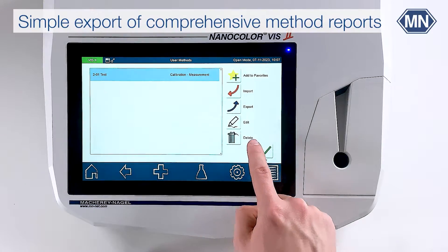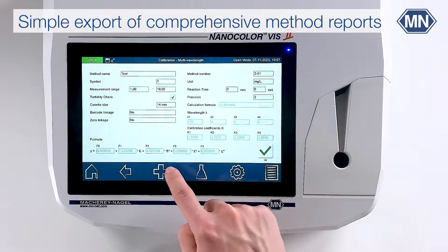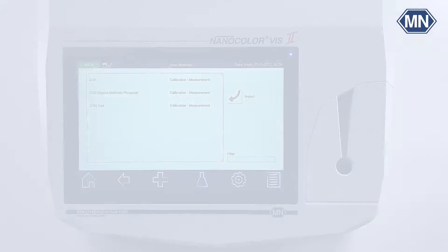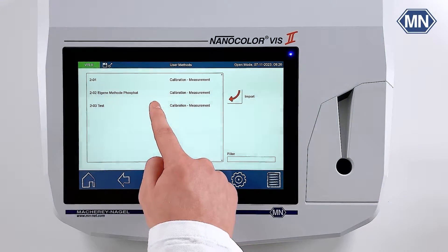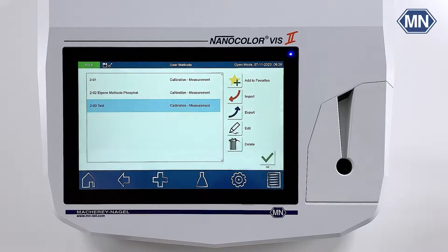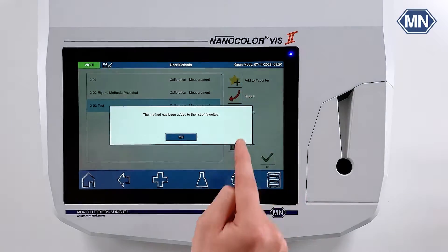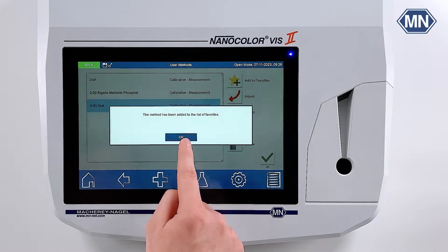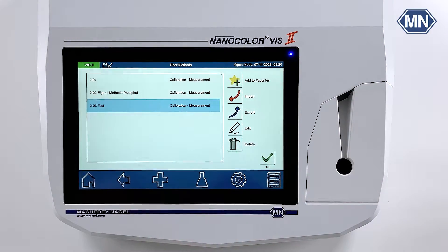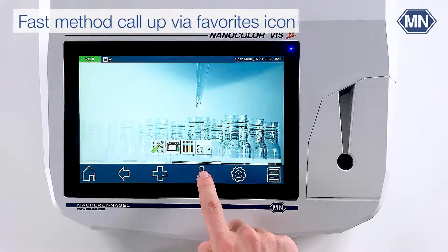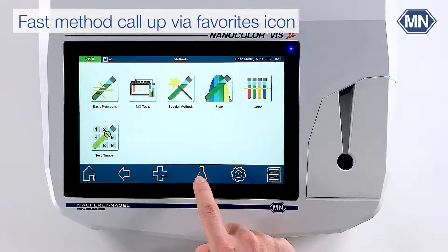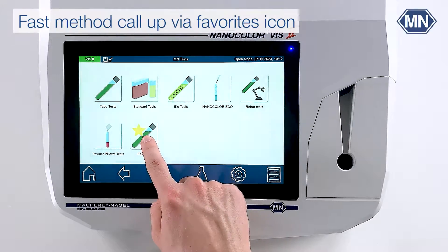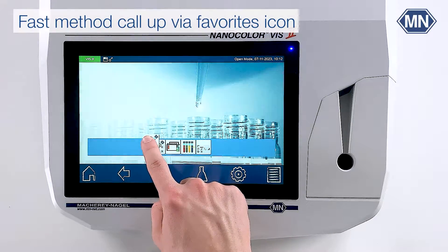From the list, you can edit, print and export your method. Each method will get a unique method ID and can easily be added to the list of favorite methods. For a more user-friendly call-up, we recommend linking the favorite icon to the instrument's start screen.